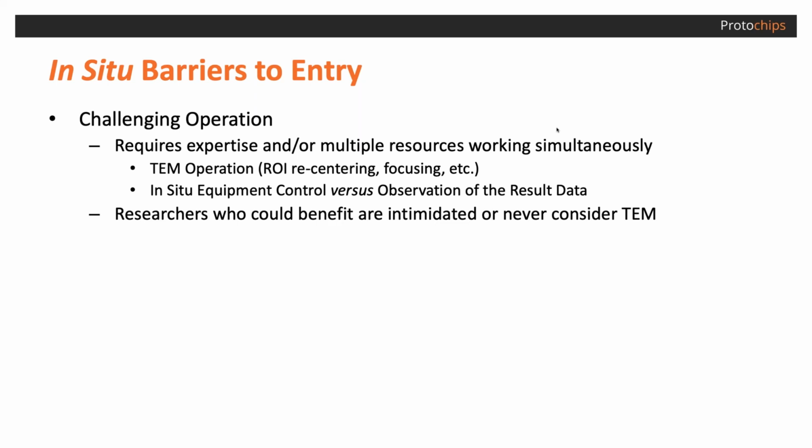And so the sample will move around quite a bit. And so the work that's done in the microscope is typically done at lower magnifications. Therefore, you will not be accessing very high mags and high resolution data because the goal is to keep it at a low enough mag that you can never lose the area of interest that happens to be moving sometimes quite aggressively across the screen.